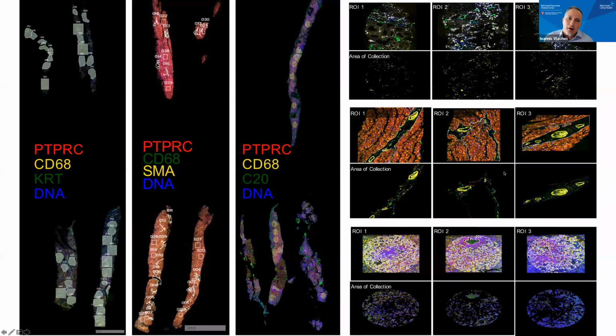So our team continued the investigation and generated spatial and single nucleus sequencing data from additional organs. We see here kidney, heart, spleen. And I again wanted to stress the importance of bringing people together around the same problem and owning it. So the strategy for region of interest selection was adapted to each organ.